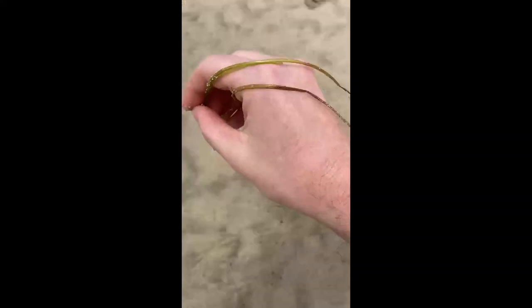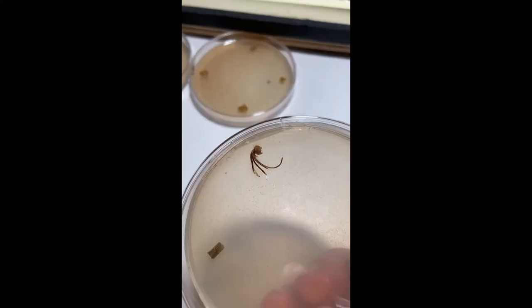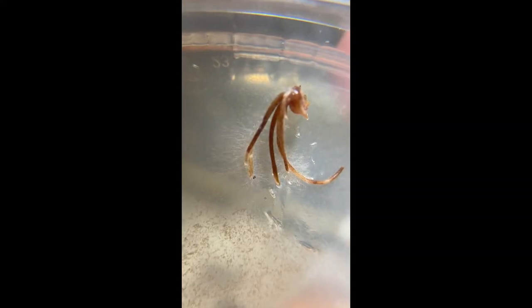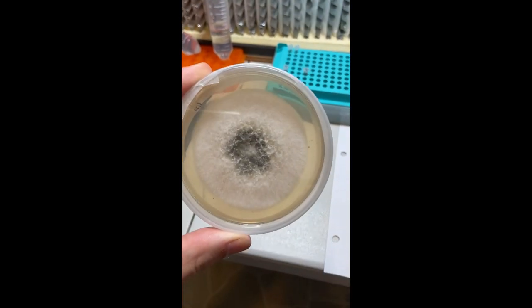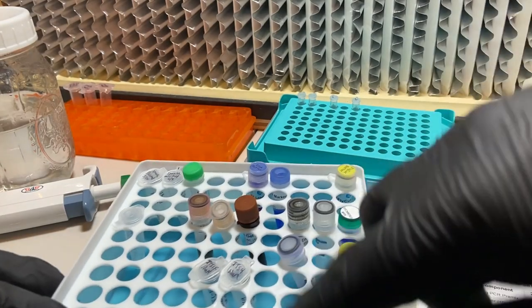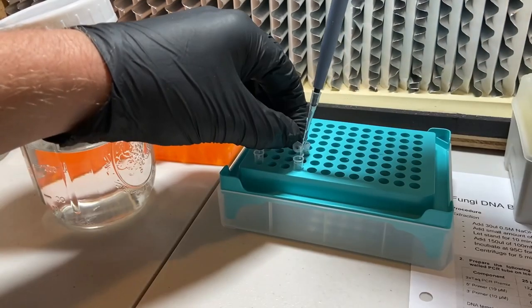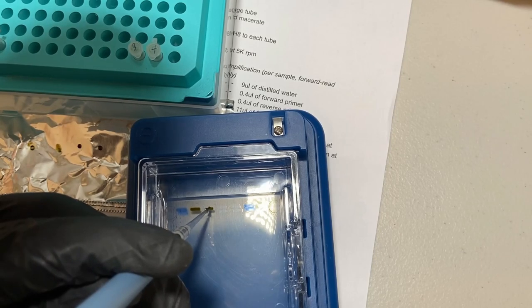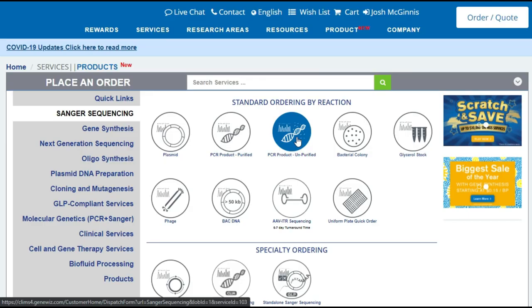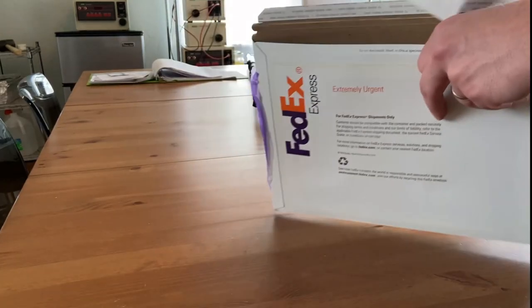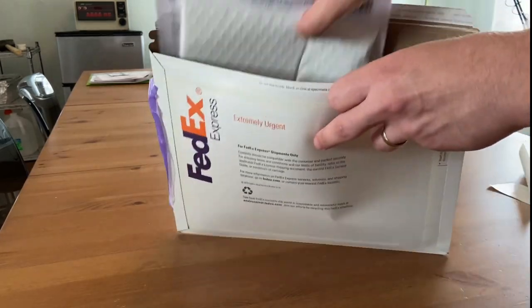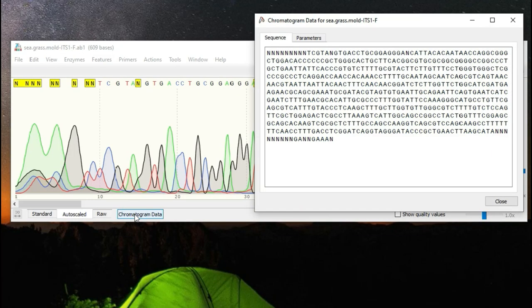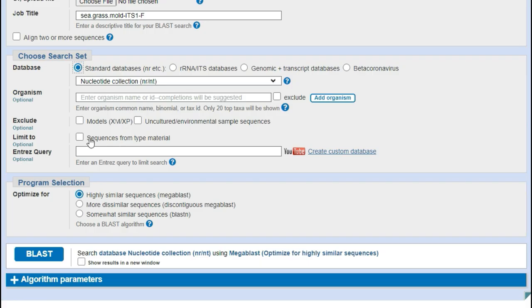In the last video, I showed you how I collected and isolated fungi from some seagrass and performed DNA extraction and PCR on it so that we can DNA barcode the organism and get a proper ID. In this video, we'll continue where we left off by reviewing how to order sequencing online, how to prepare and ship the sample to the lab, and finally how to review and interpret your sequencing results. Let's dive in.